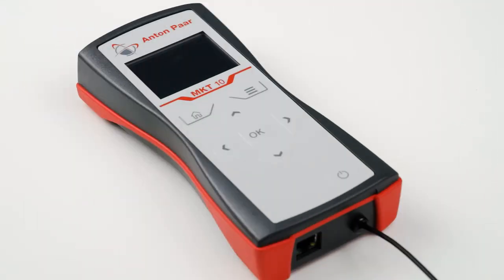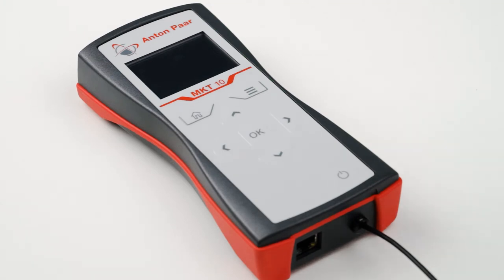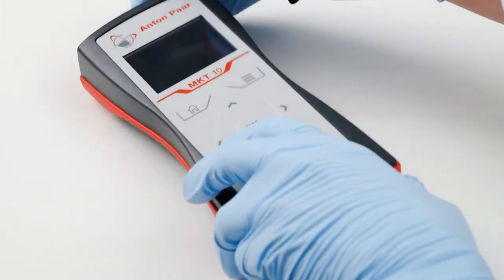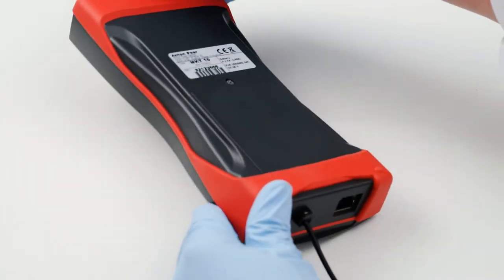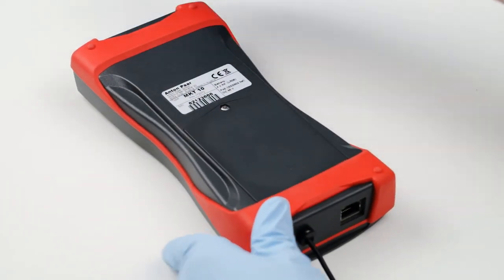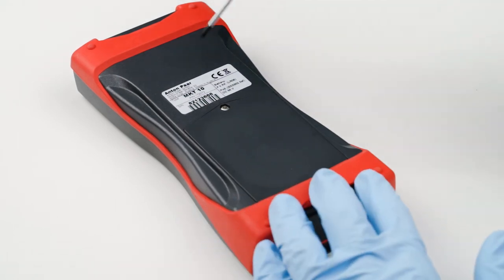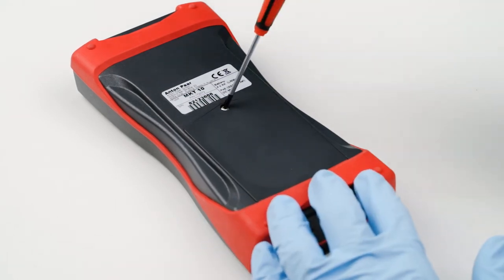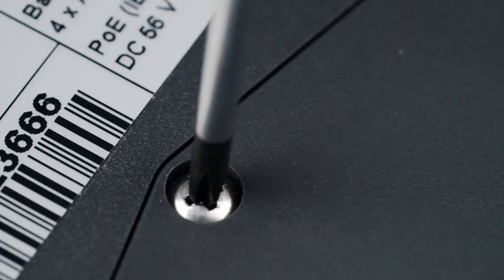If the battery charge status is discharged and the display stays dark, change the batteries. To do so, carefully remove the battery compartment lid by unscrewing the two screws on the back of the device.